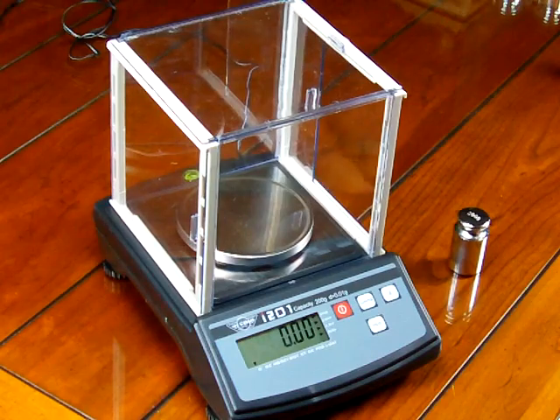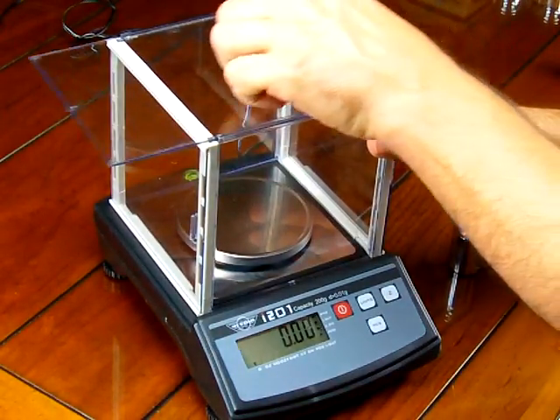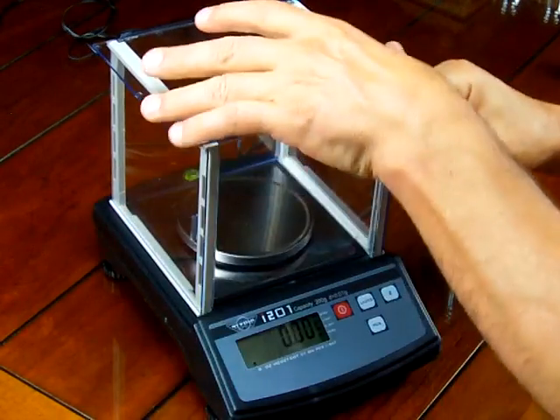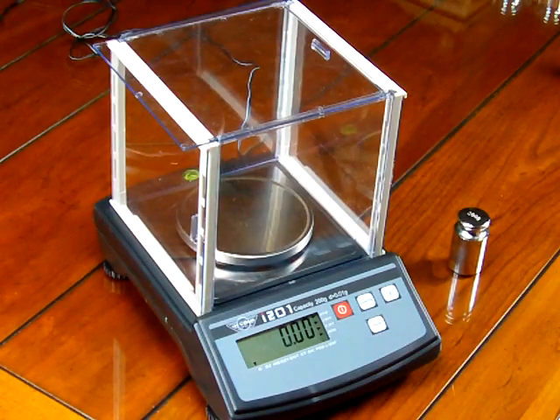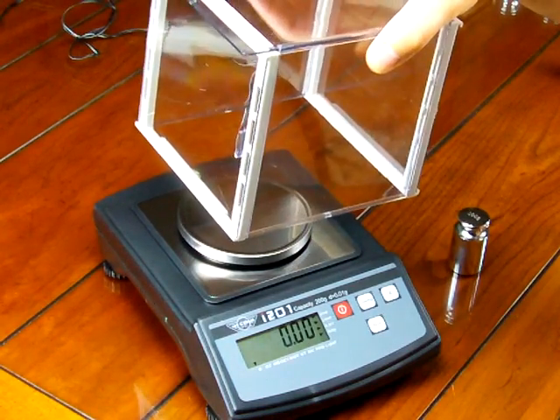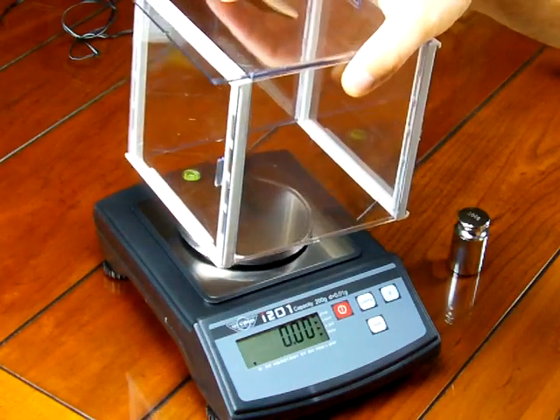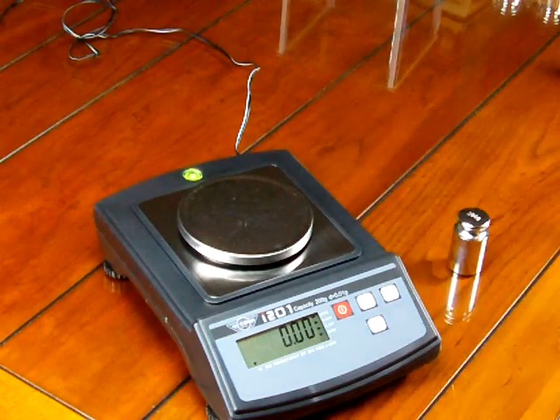Let's go over some of the other features that the i201 balance offers. It comes with a plastic draft shield with three doors: a top door and two side doors. A lot of people don't bother using it, but it's a nice inclusion — a lot of competitive brands don't include a draft shield. If you want to use it, use it; if not, you can run the balance without it.